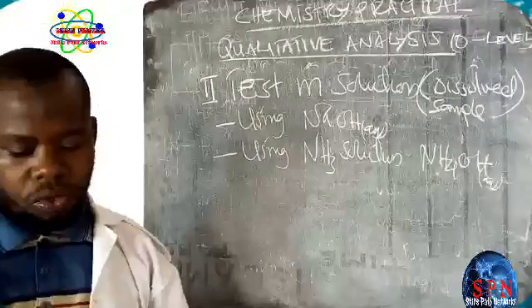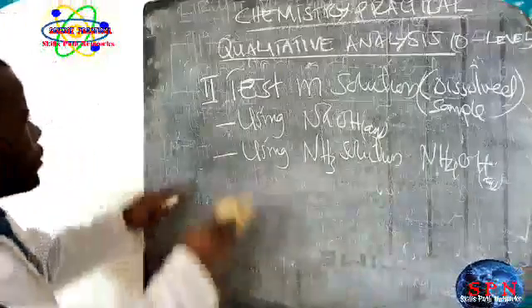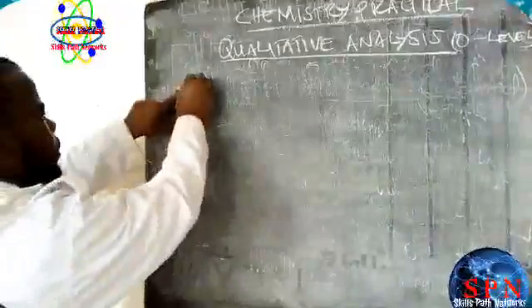After testing in solution, we go to the confirmatory test, which is the third.